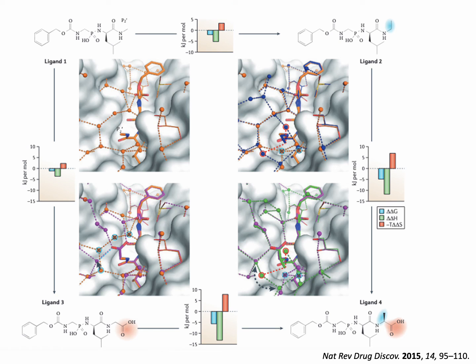Furthermore, the thermodynamics of binding is influenced by multiple factors, including hydrogen bonding and hydrophobic interaction, desolvation, residue mobility, dynamics, and local water structure. ITC could help in understanding the effects of these factors and applying the knowledge in drug discovery. Here is an example of scientists utilizing the ITC technique to do fragment-based drug development.